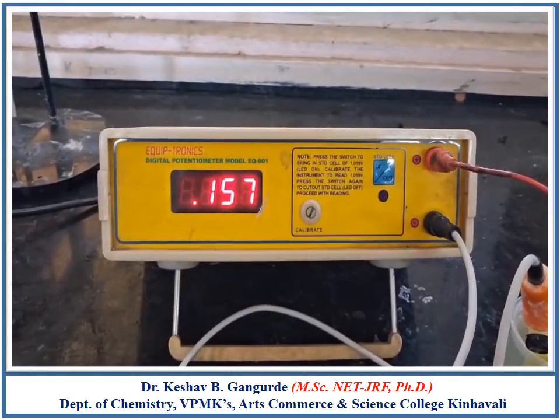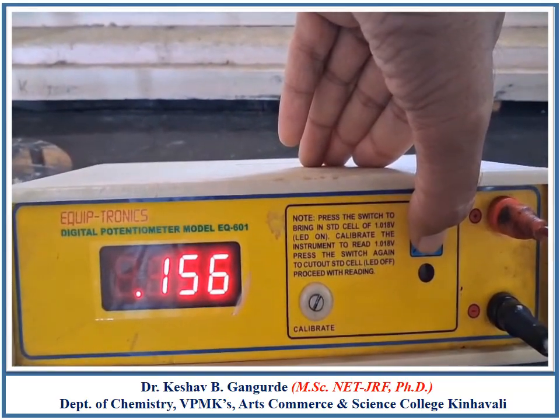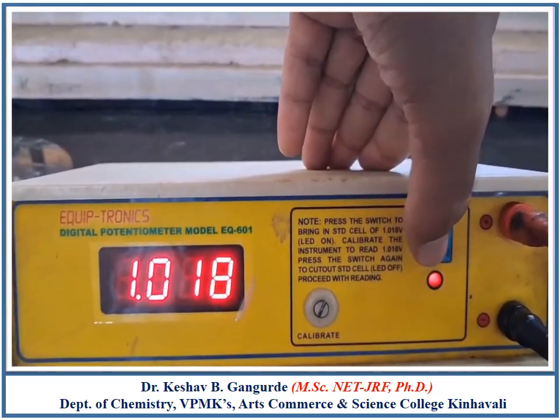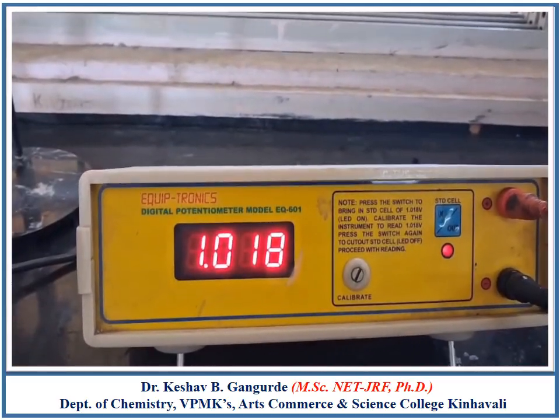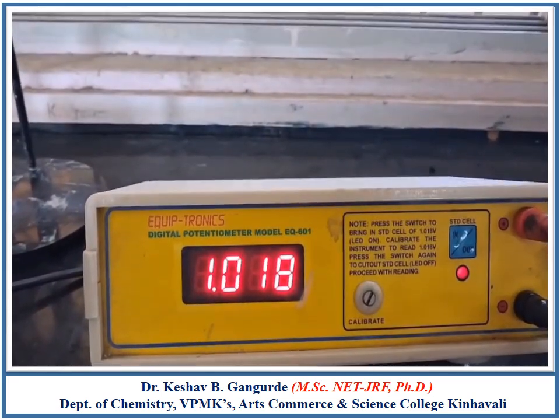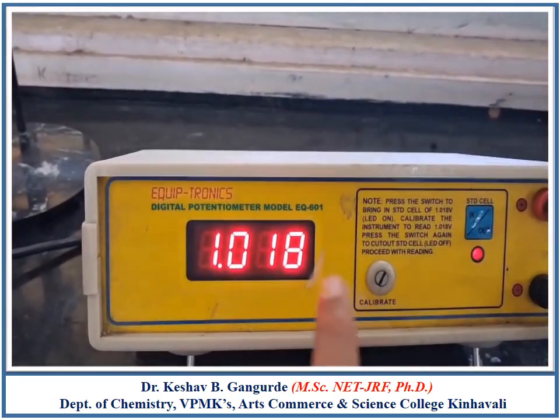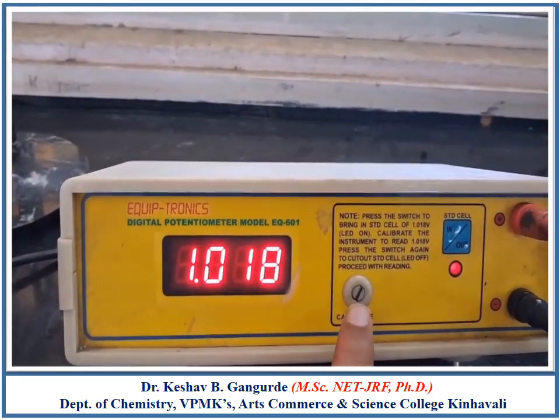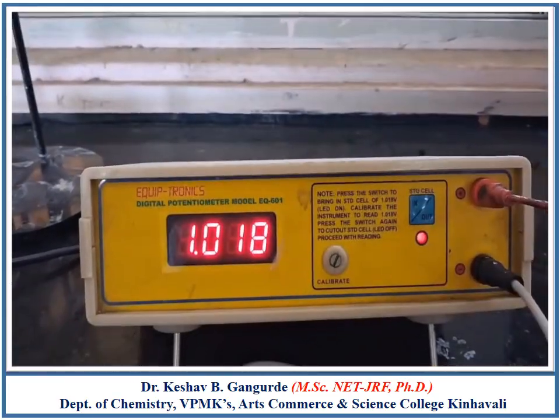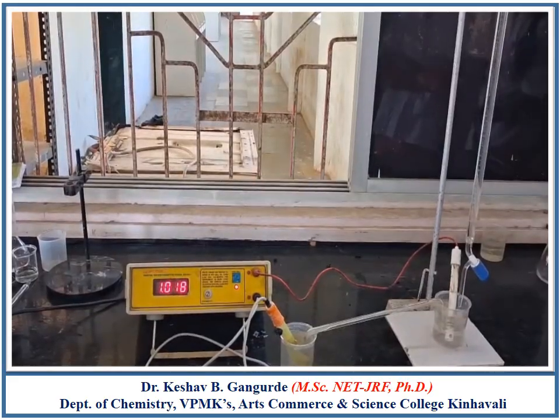Connect both the half cells by using salt bridge. Now do the standardization of potentiometer. For this, connect the standard Weston cell by pressing this knob. LED will be on. As the potential of standard cell is 1.018 volt, the instrument should read 1.018 volt. If not, adjust the reading on the display by using the calibration knob up to 1.018 volt. In this way, standardize the potentiometer.